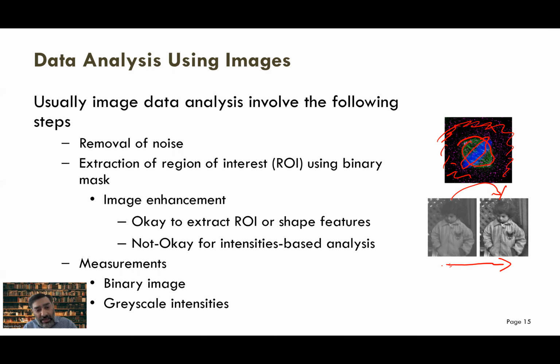If we are doing any sort of intensity-based analysis, then this image enhancement is no good, because we really want to capture the intensity of a region of interest, because this intensity is representative of something that could be due to the level of protein in that part of the image, right?